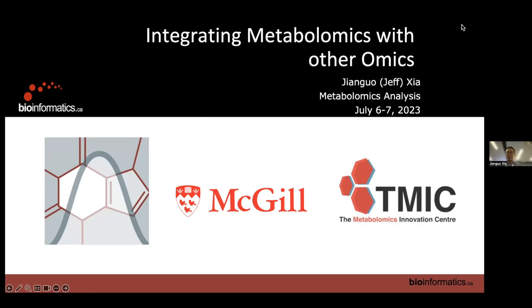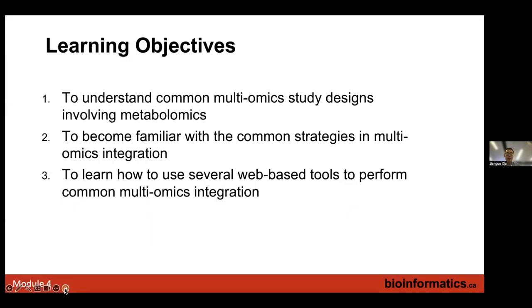This is a topic I get so many questions about, from the beginning till the end. So we leave it to the last section: how to integrate metabolomics with other omics, or what we call multi-omics, but including metabolomics. What we would like to show in this last module is to understand multi-omics study designs involving metabolomics.